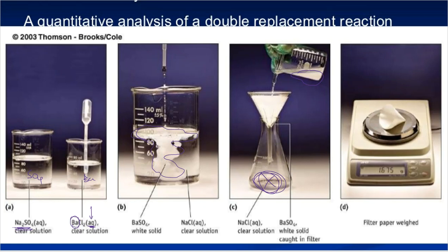On a job listing, if you're reading across these big words that sound fancy, and you run across gravimetric analysis, you need to feel pretty good about that technique, because it's one of the simplest techniques in a laboratory. This could be a make-it-or-break-it opportunity, because they might ask you about gravimetric analysis in the interview process.